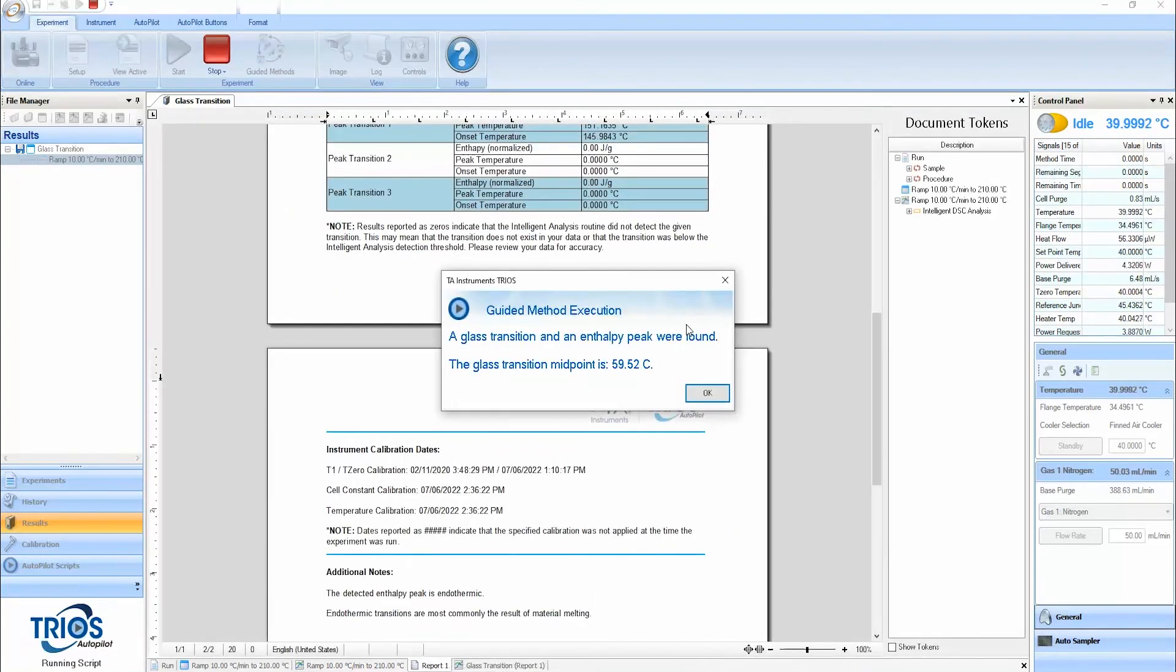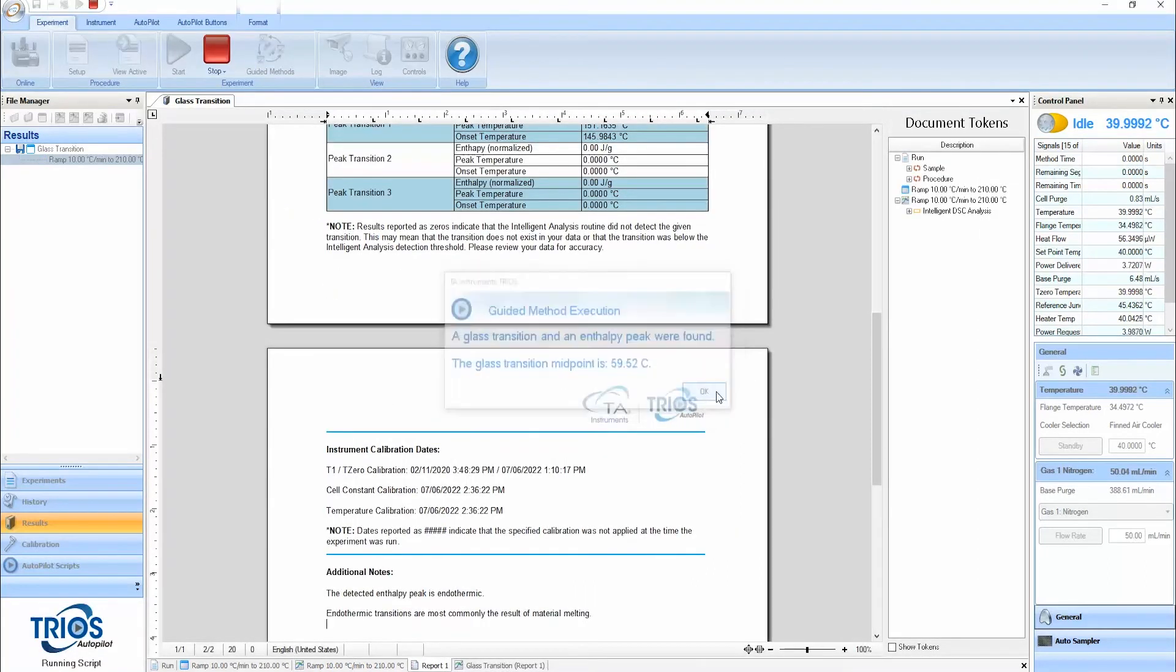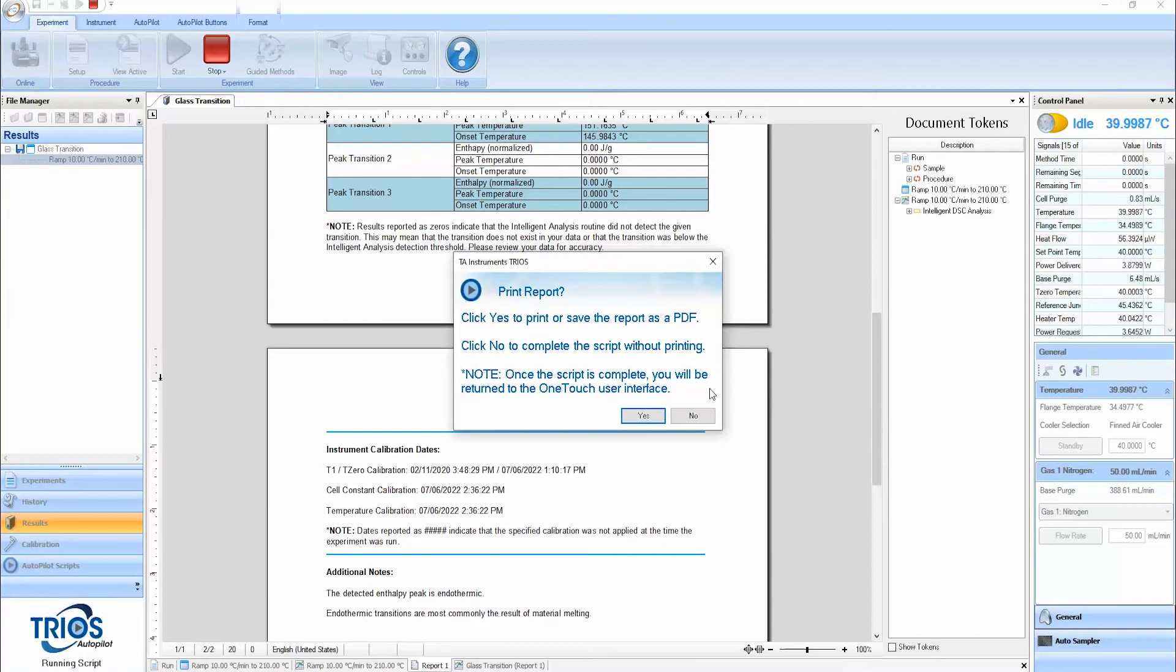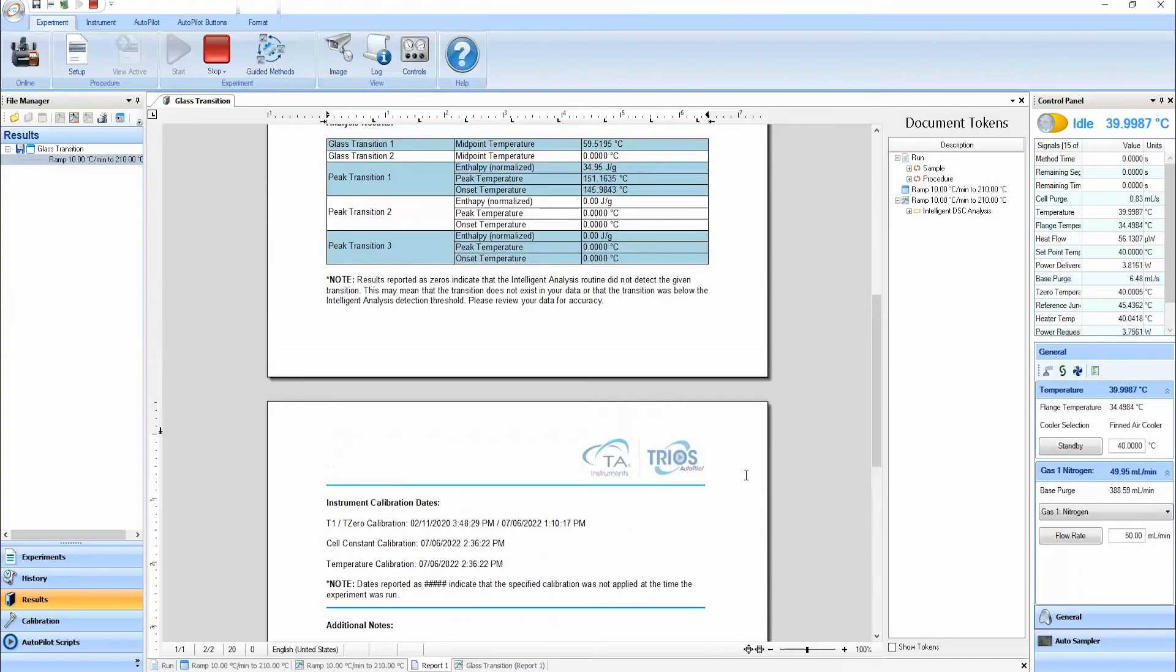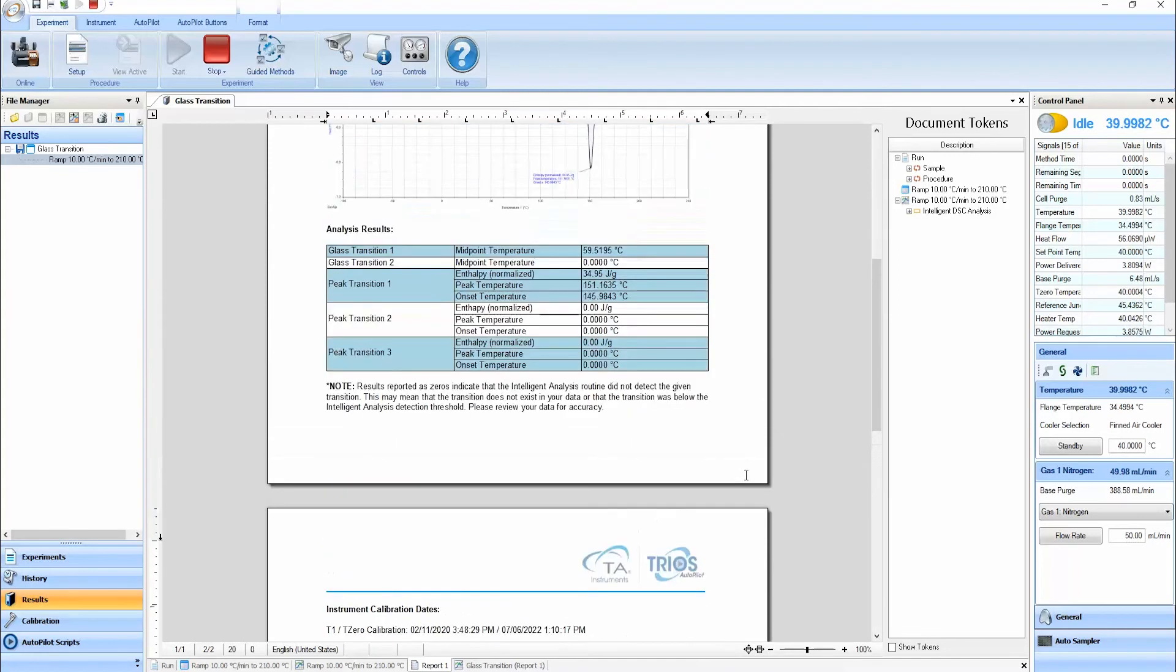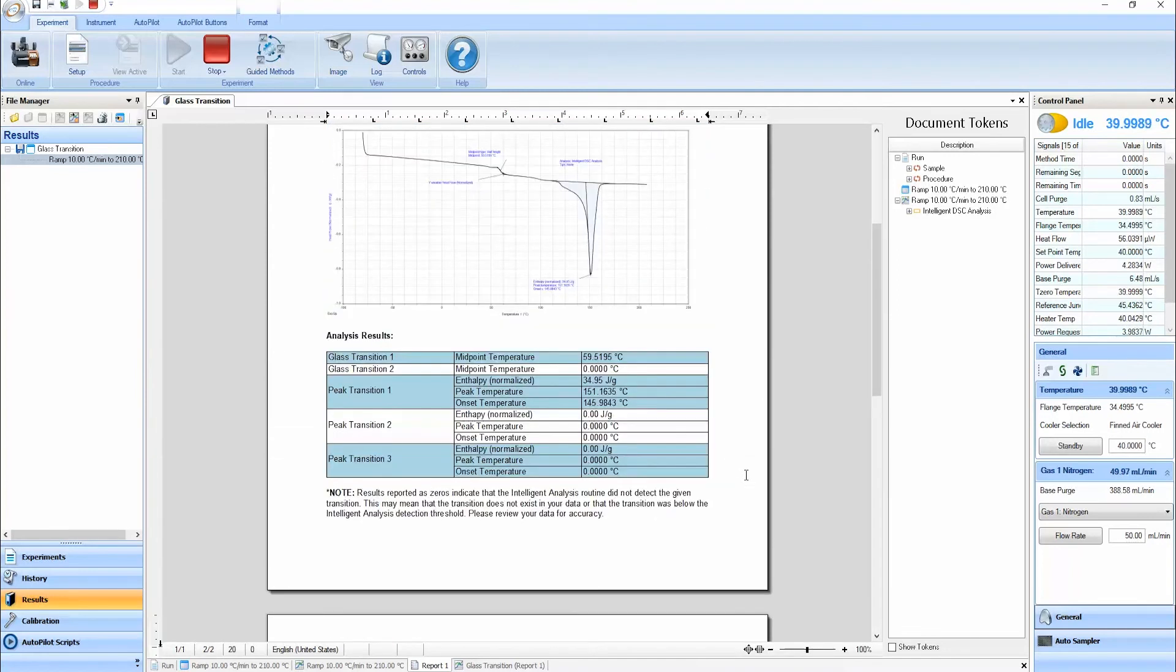After the test is done, the guided method will automatically execute intelligent analysis to identify all detectable thermal transition events and the glass transition temperature. Following this, the results are reported in an easy to export format.